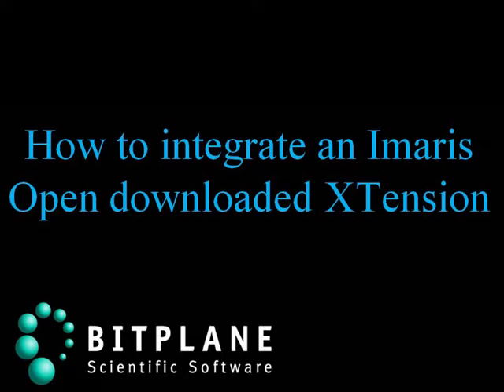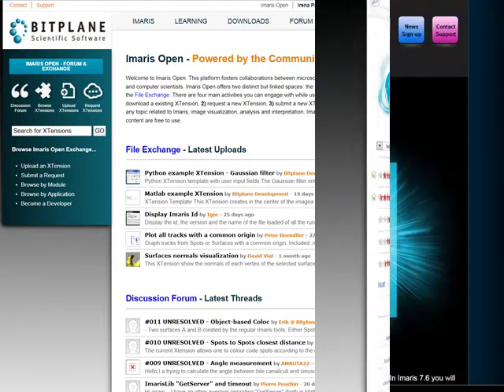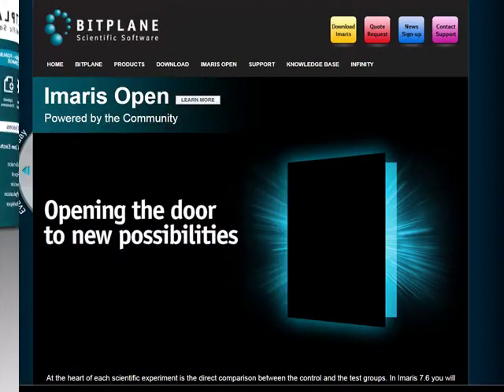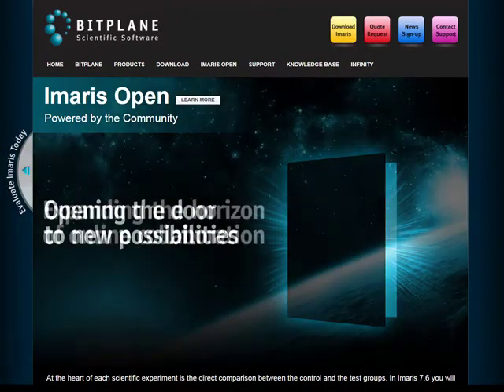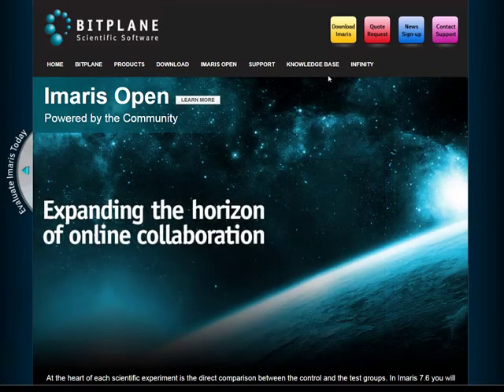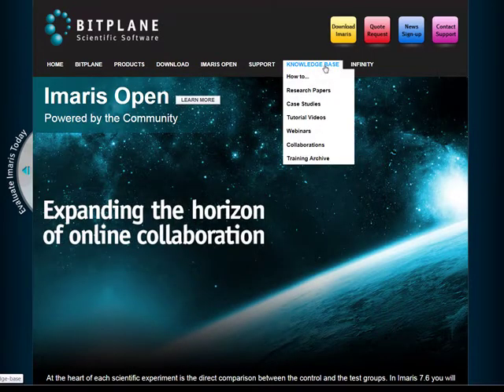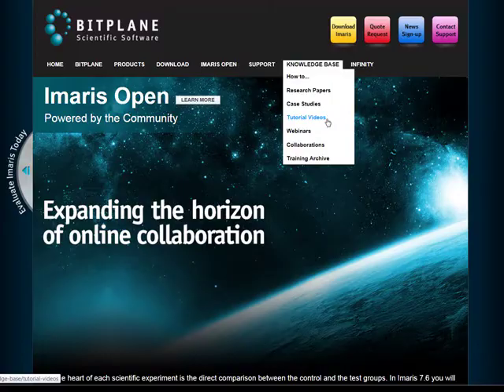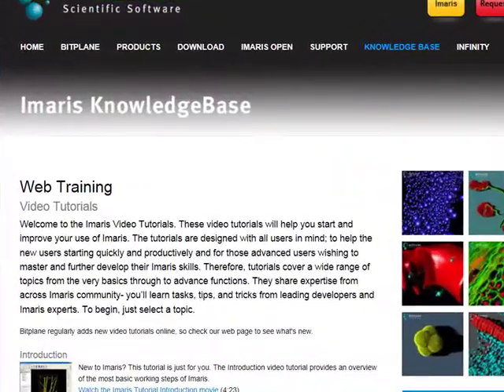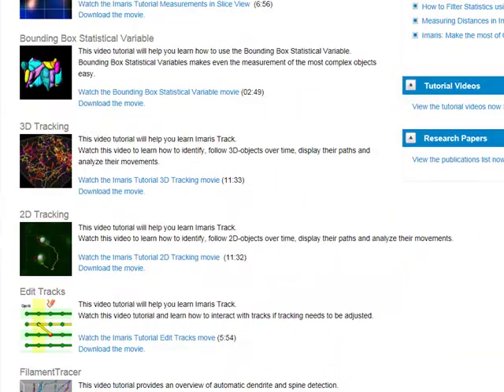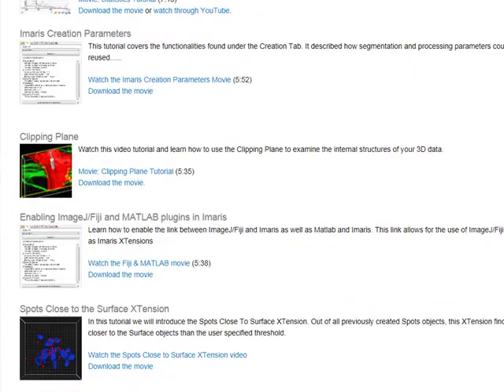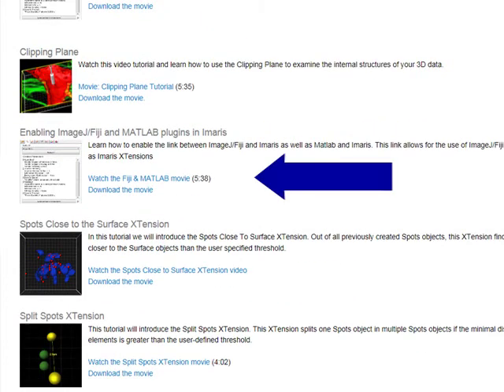This video demonstrates how to integrate an extension downloaded from the Imaris Open page within Imaris. In this video tutorial, we assume that MATLAB or MATLAB compiler runtime are already installed on your system. If not, please visit our webpage and refer to the installation instructions in the MATLAB video tutorial.